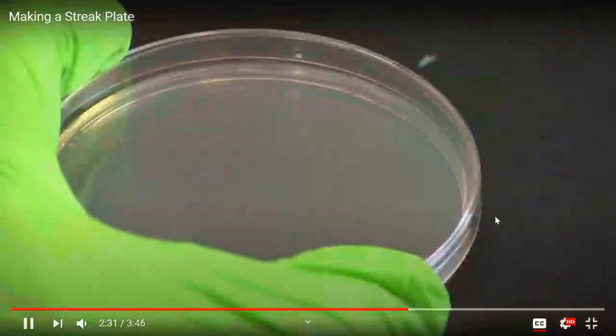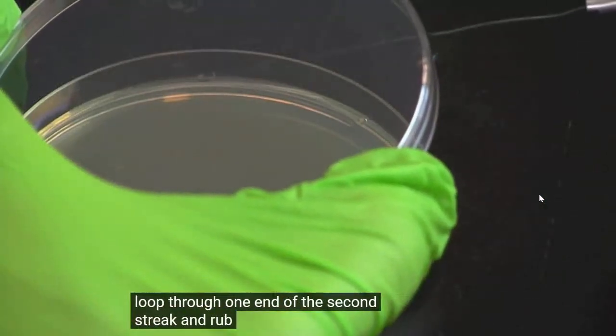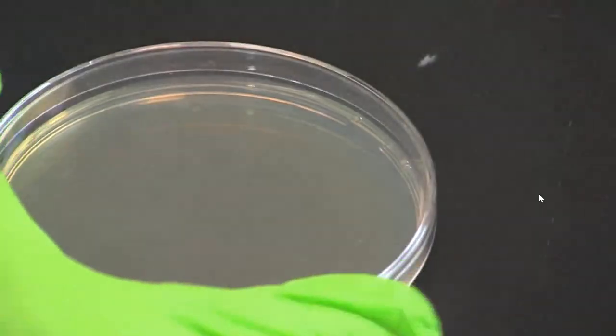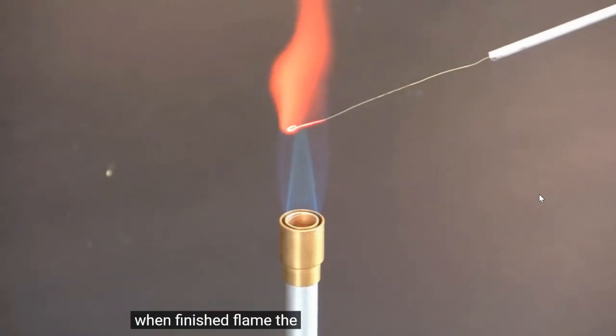So you're going to see how he goes into the previous streak sometime, several times, and then he stays out of it, right, to spread out those bacteria. When finished, flame the loop again.